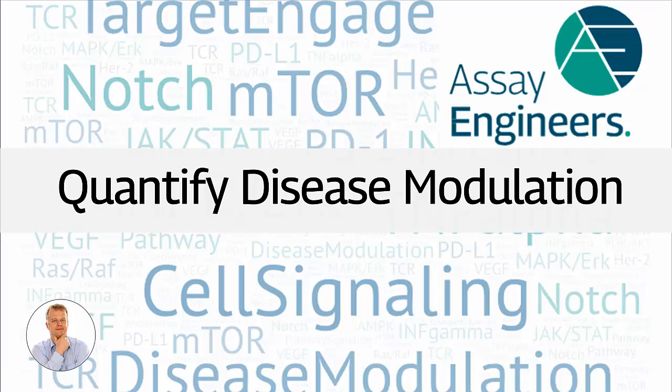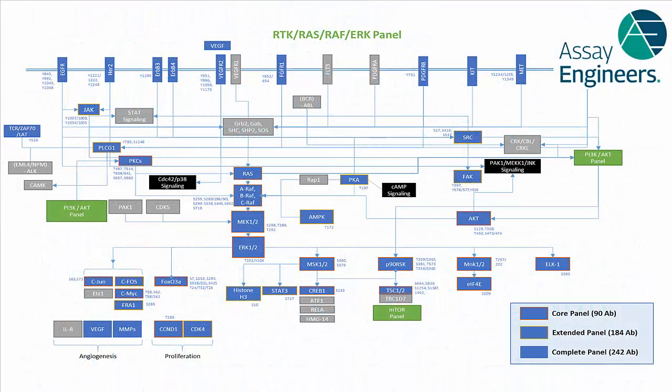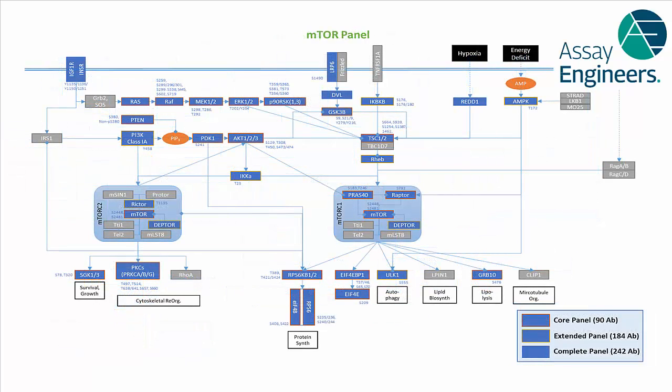The assay menu currently includes more than 1,250 markers covering the top 10% of the intracellular proteome. You can choose from more than 60 expert-curated pathways, including FDA-approved companion diagnostic markers. The assay configurator currently includes more than 300 phosphoproteins that are not measurable by other platforms.